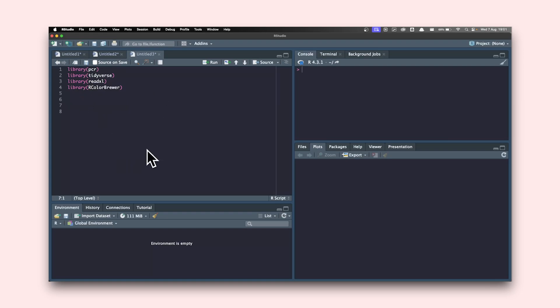When you start a new script in R and you want to use the utilities inside the PCR package, you need to call library() and inside the brackets call the package. Then go to the end of the line and hit Command+Enter. That's going to load the package into your environment.